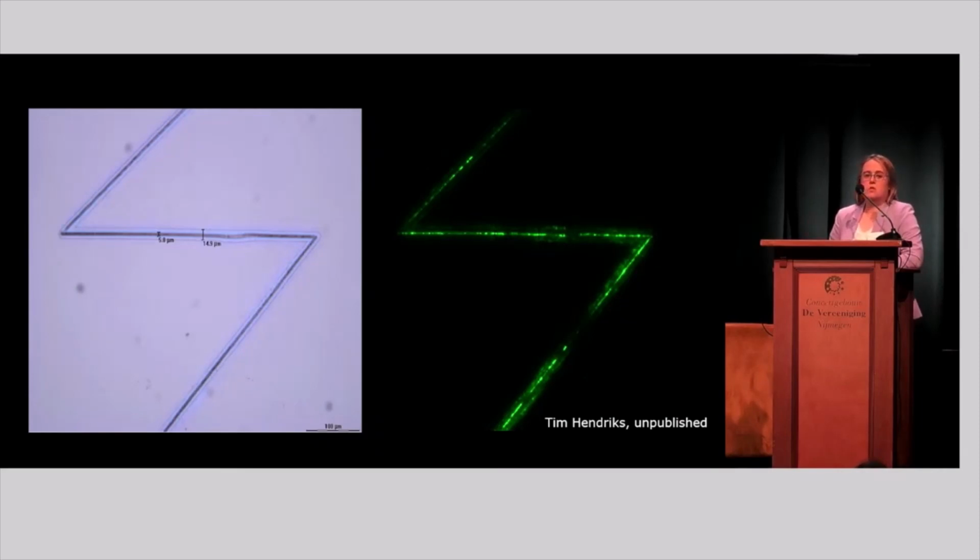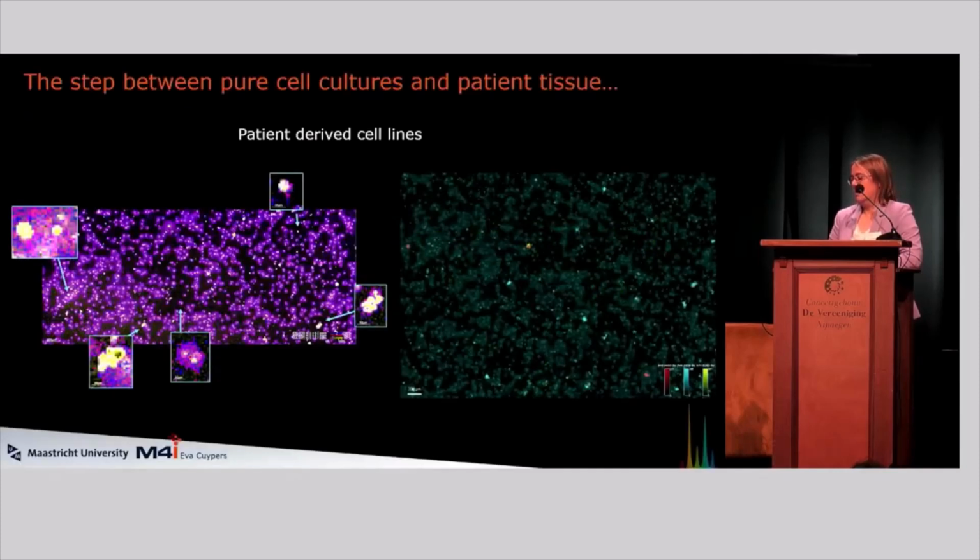But this helps us improve the overlay error a lot, which we of course want to limit as much as possible, because otherwise we annotate a different or the wrong mass spectrum to the wrong cell type. So this is really an important parameter if we want to build decent and reliable databases.